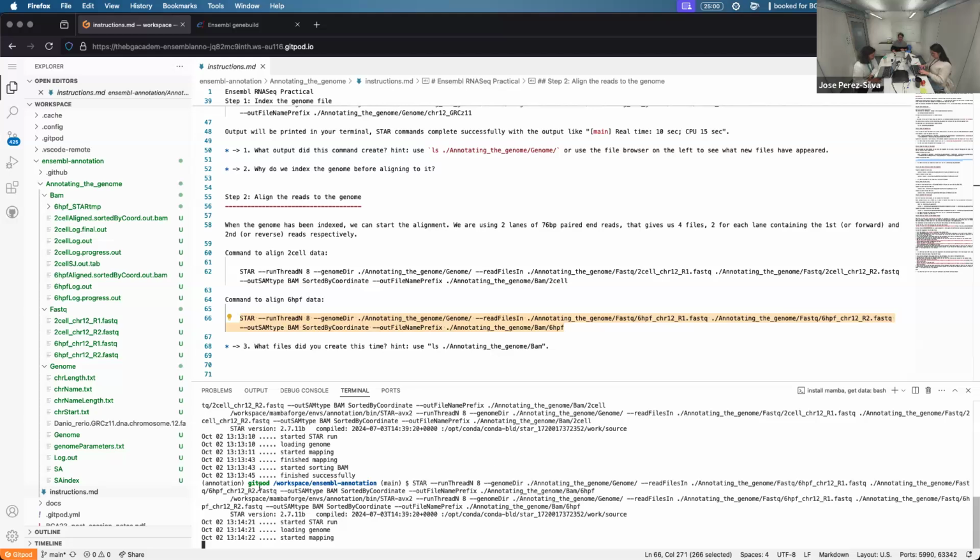And we can maybe now pay some attention to the standard output we get, which is, again, pretty straightforward, a log of time and what the software is doing. If you go over it, it's pretty straightforward: loaded genome, start mapping, finish mapping, sorting BAM, finished.